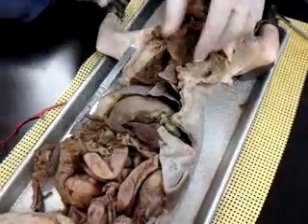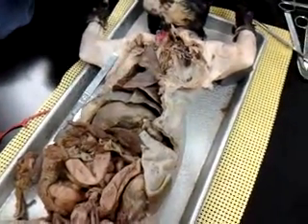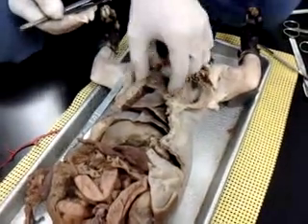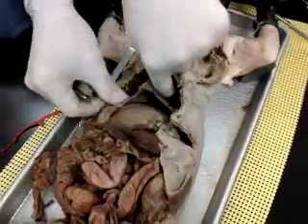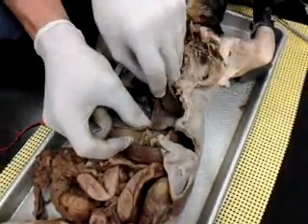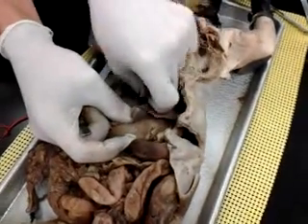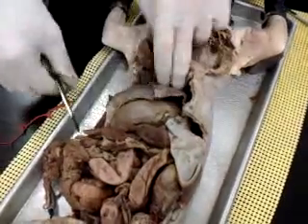So these are lobes of the lung. Now in the human, you're going to have to identify the lobes. Human on the right lung is the superior, middle, and inferior lobe. Left lung only has a superior and inferior lobe. Cat has a few more lobes than we do, so you don't need to know the names of the lobes in the cat. So if you look at that sheet, the things with an asterisk are things you need on the human model, not so much with the cat, because they'll vary a bit.